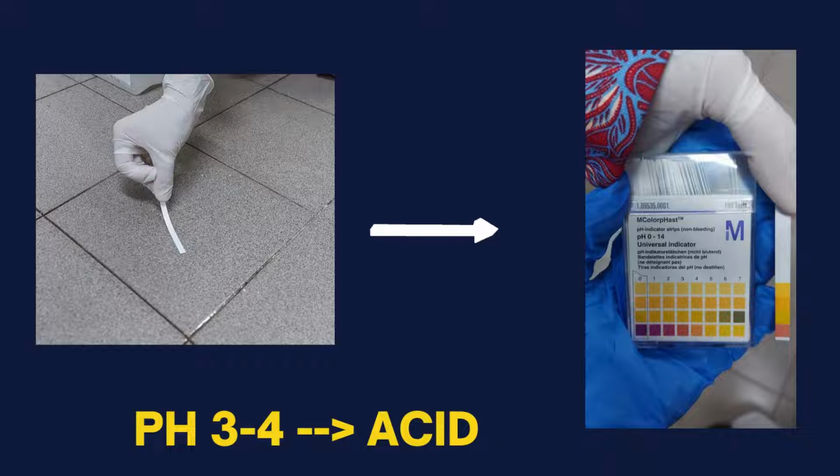So this is an example of a spillage scenario of acetic acid. First we have to determine if acetic acid is corrosive or not. From the MSDS, we know that acetic acid is corrosive. Thus, the next step we have to take is to determine the pH of the spilled acetic acid. We use the pH paper.